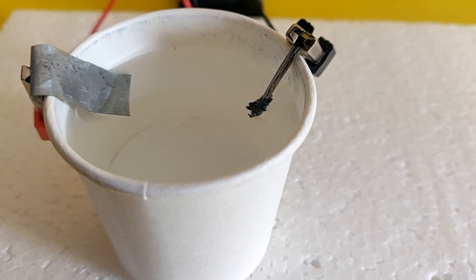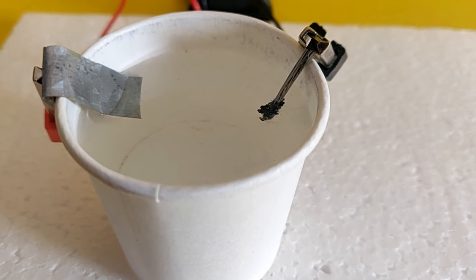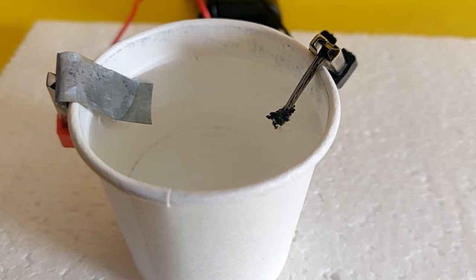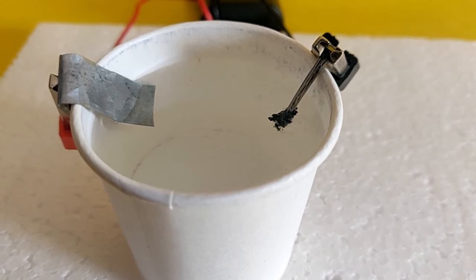Soon you will note there is a grey coating formed on the iron nail. This is zinc from the zinc sulfate solution being deposited on the iron nail.